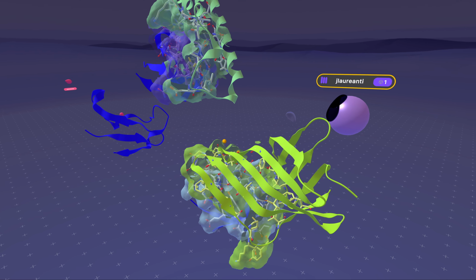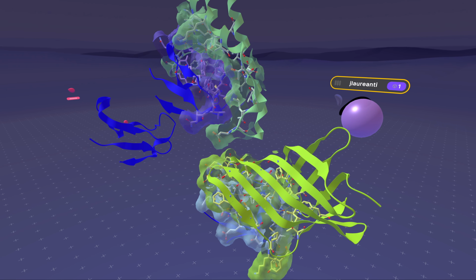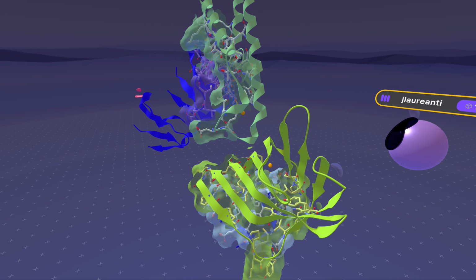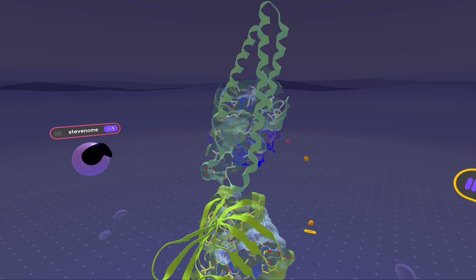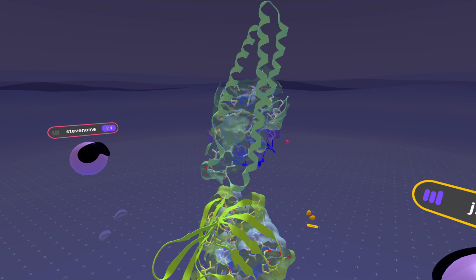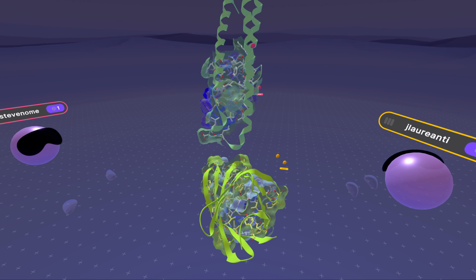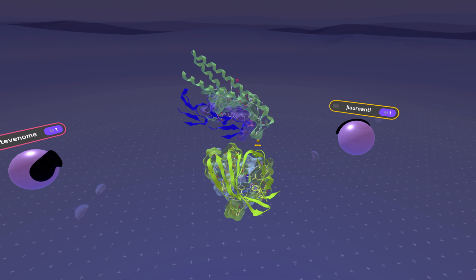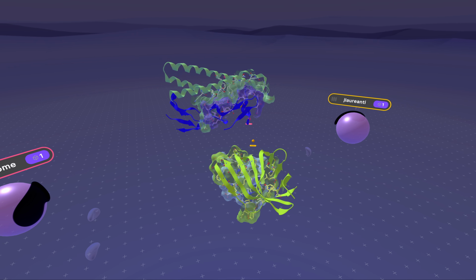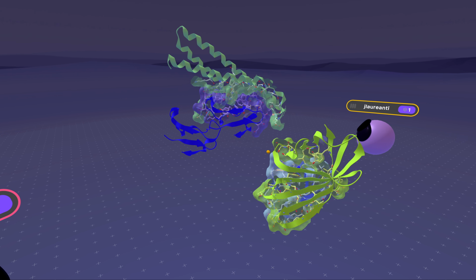Honestly, I would go with the alpha helices, just because in my history, beta sheets are harder for me to work with, and things that are all alpha helical seem to express and purify nicely. I guess from my perspective, this alpha helix bundle is sitting on the surface in a way where it doesn't need to deform too much.